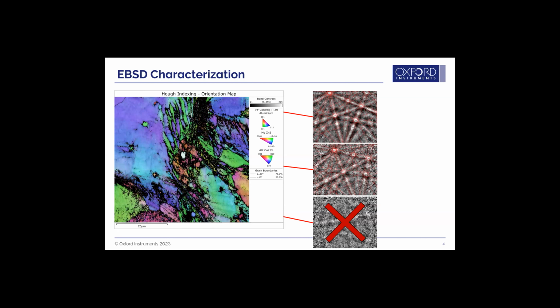One of the things that was noticed in the analysis was there were inclusions in the sample. There was a magnesium zinc inclusion. There was a copper iron inclusion that was noted in this. So if we look at the phase map, we see these inclusions peppered about, but it actually represents another problem in this sample.